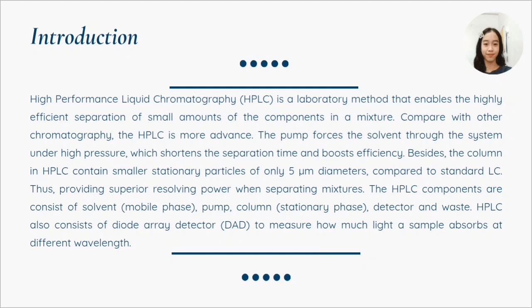Introduction. High Performance Liquid Chromatography (HPLC) is a laboratory method that enables the highly efficient separation of small amounts of the components in a mixture. Compared with other chromatography, HPLC is more advanced. The pump forces the solvent through the system under high pressure, which shortens the separation time and boosts efficiency.